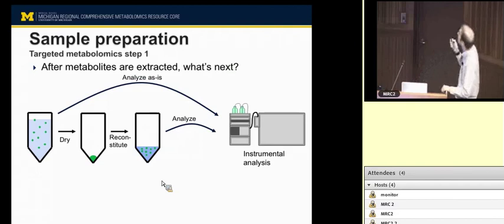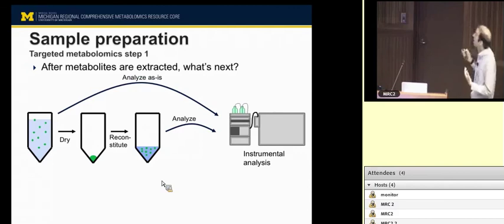And then data analysis and interpretation, oftentimes that's where things transition back to you. We can either hand you a table, a spreadsheet with numbers on it that you'll be ready to interpret, or it can be more interactive.